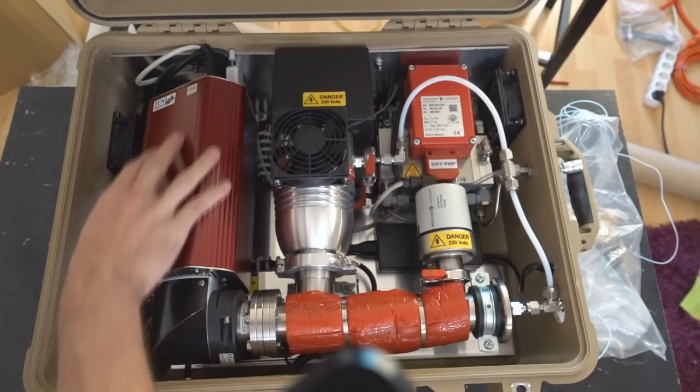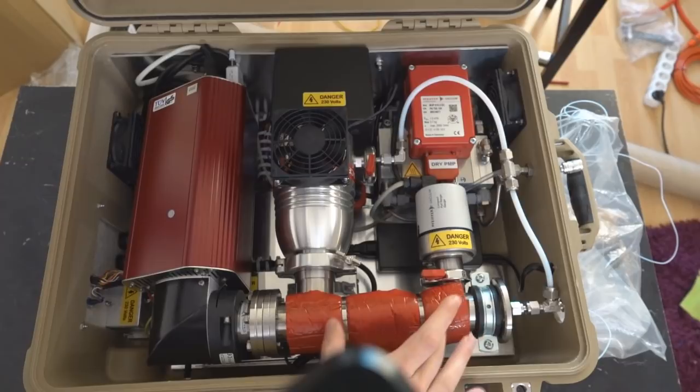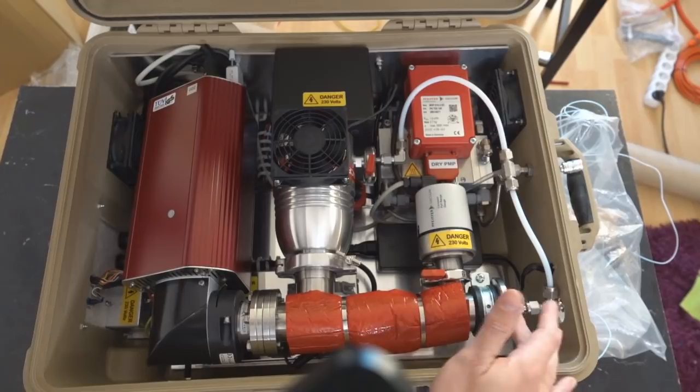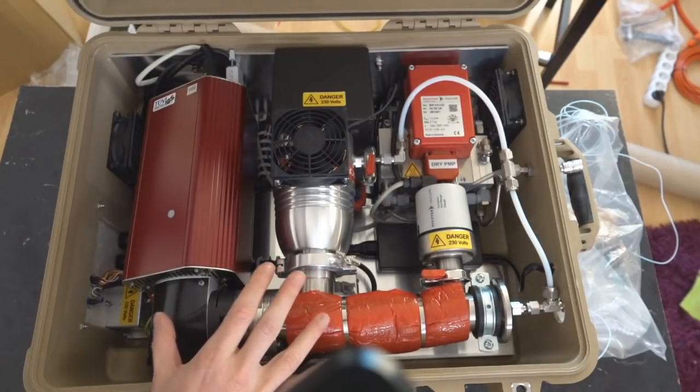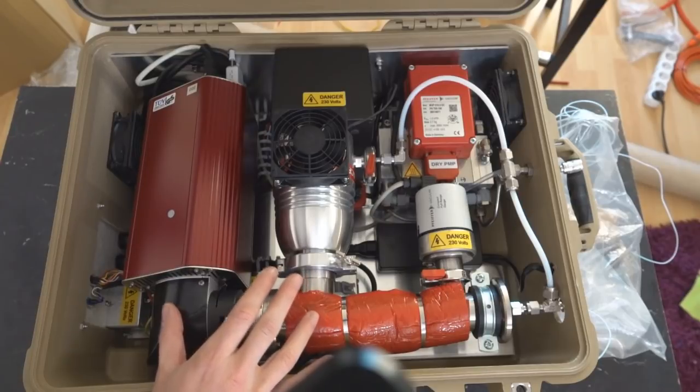They've actually flown these sorts of things on NASA space probes. So these two just give you a vacuum in this tube. That measures the vacuum in this tube. Then you bring stuff in here, and this will effectively weigh molecules for you, or separate them if you were keen.